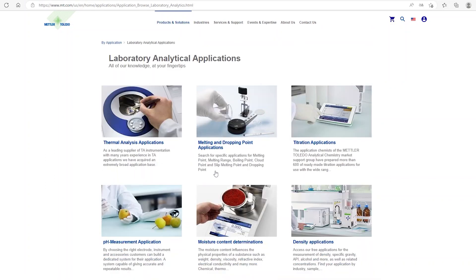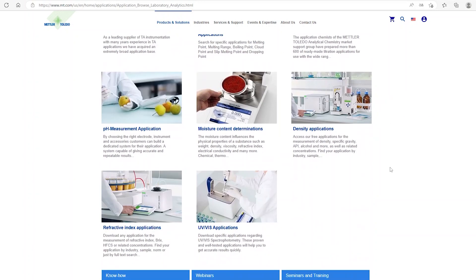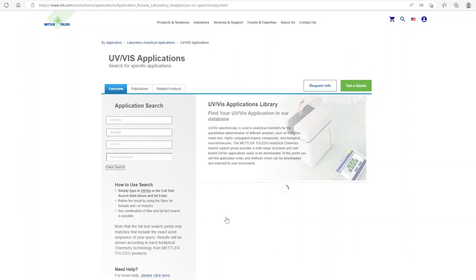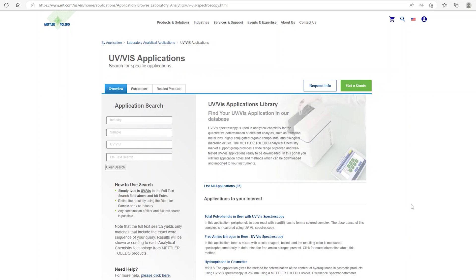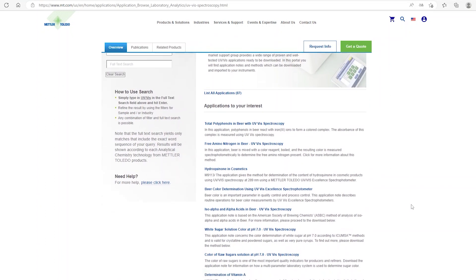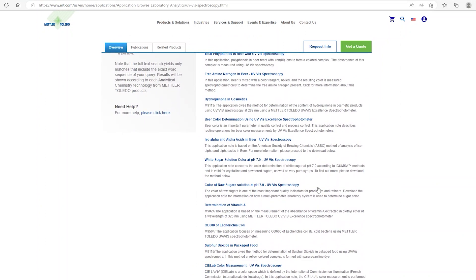Here you will find an overview of the various application libraries for all our analytical instruments. As we are looking for a new UEVS application, you can scroll down and select UEVS applications. In the UEVS application library, you can find all available application packages for Mettler Toledo UEVS spectrophotometers.